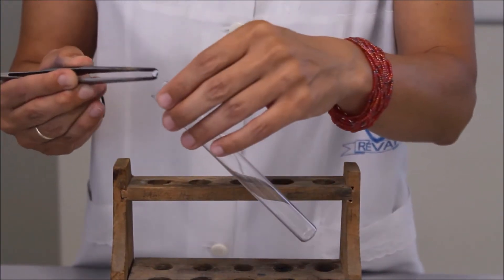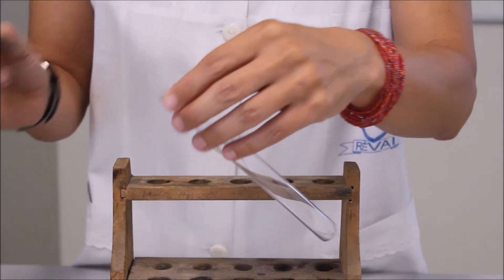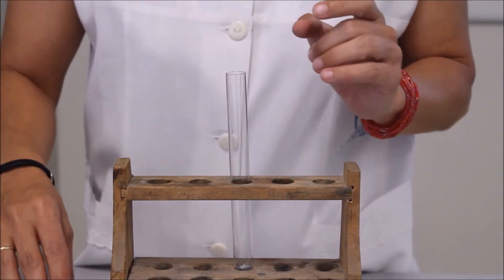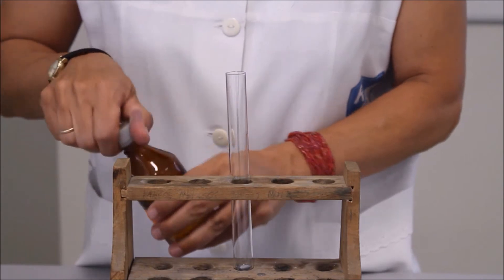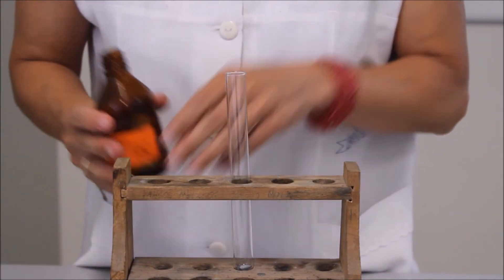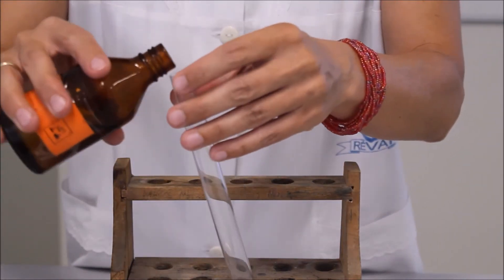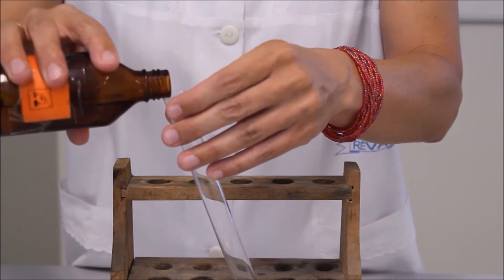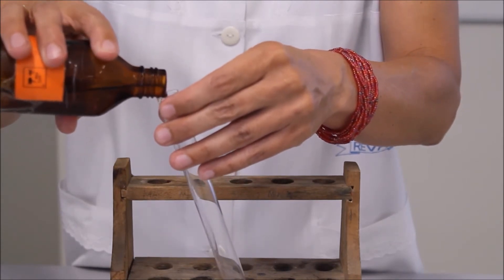Tehát nézzük közelebbről a kísérletet. Finoman engedem bele a cink darabkát, hogy ki ne üsse a kémcső fenekét, mert már bizony fordult elő ilyen. Kis diák panaszkodott, hogy húj, ki a sósav.